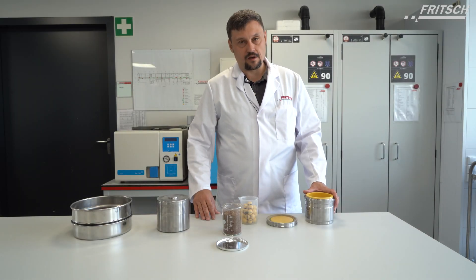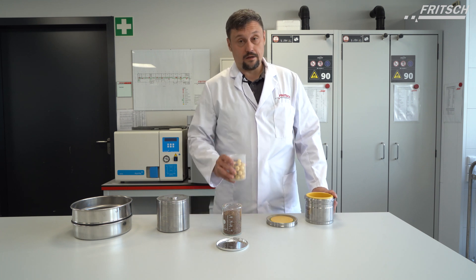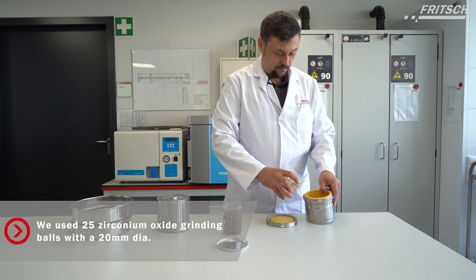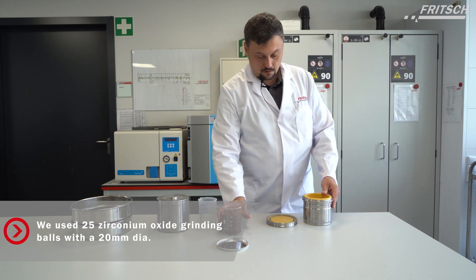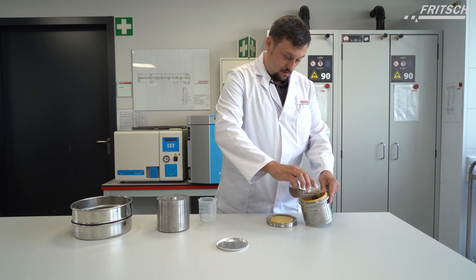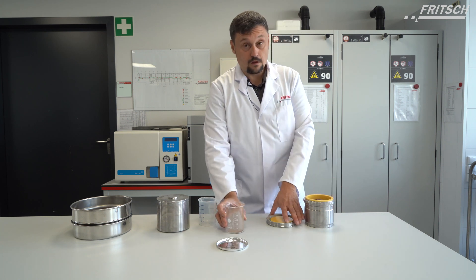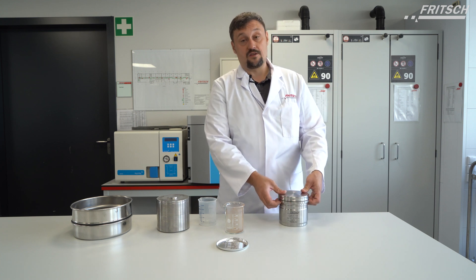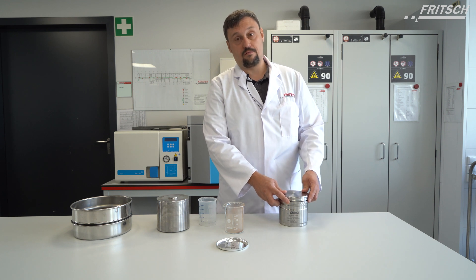Now we will prepare the second sample for the test with the balls at lower rpm. It is important to prepare first the balls inside the bowl and then add the sample. Now we can place this bowl inside the planetary ball mill Pulverisette 5 Premium.